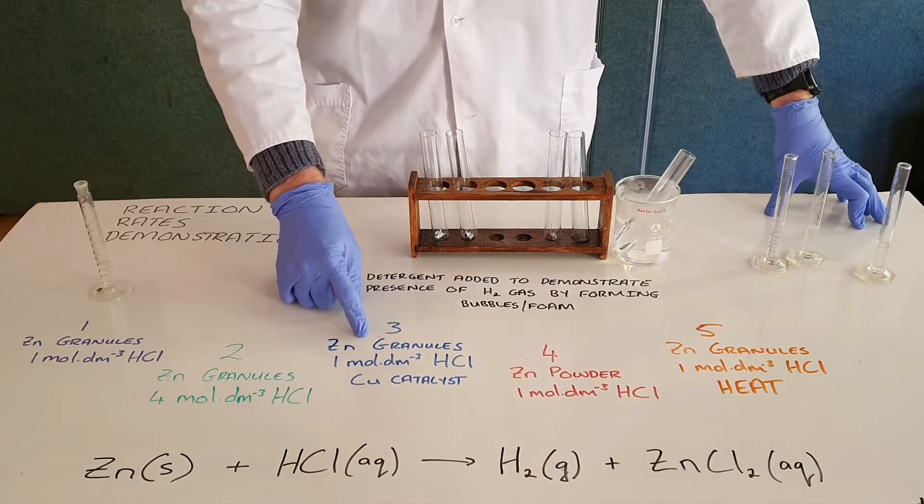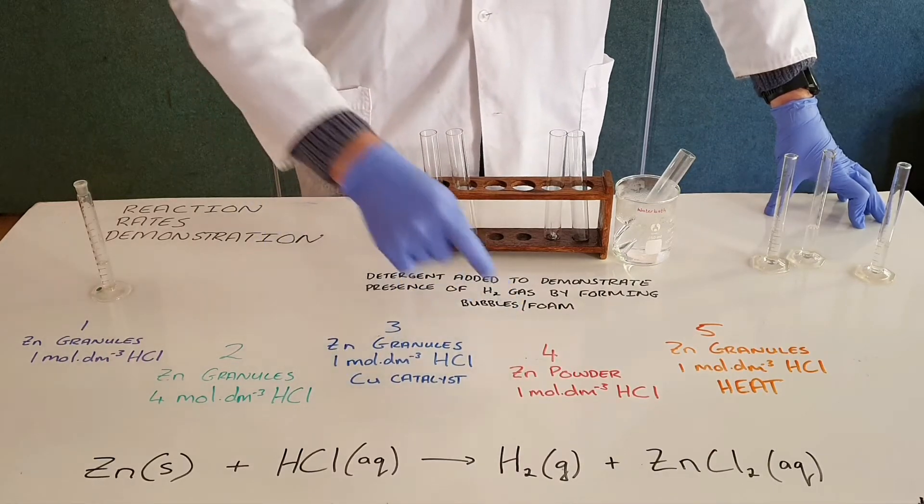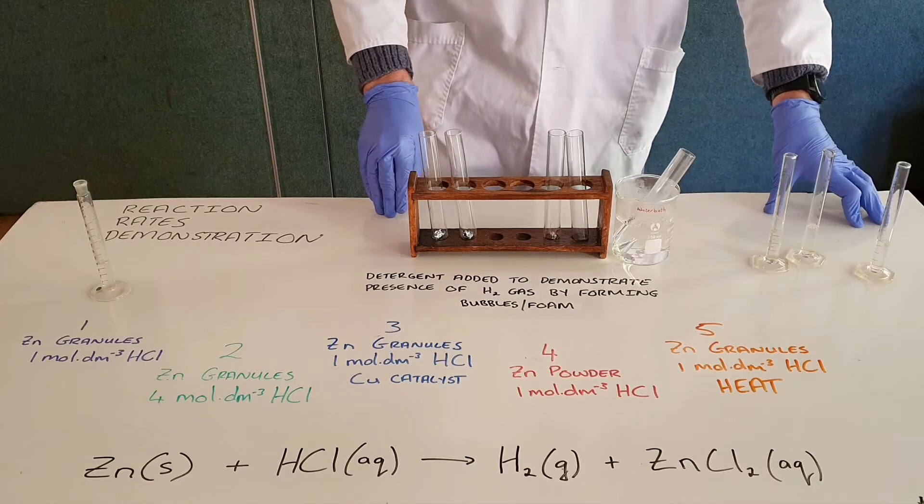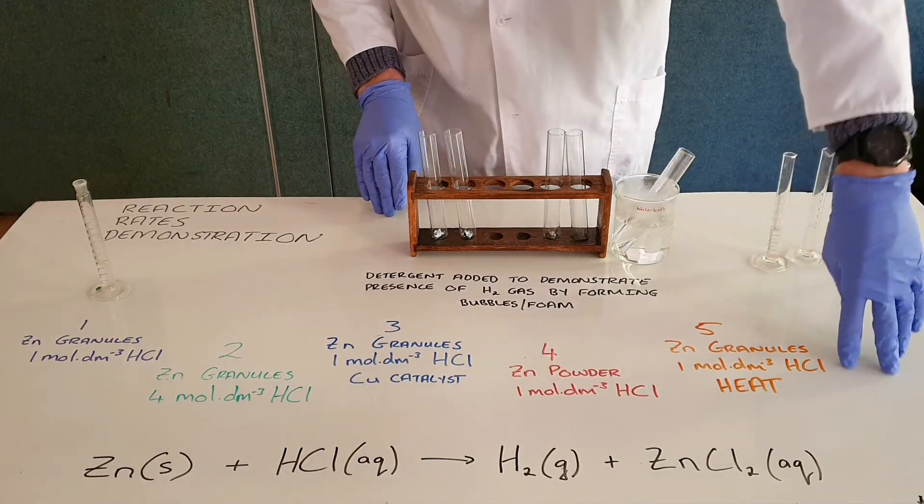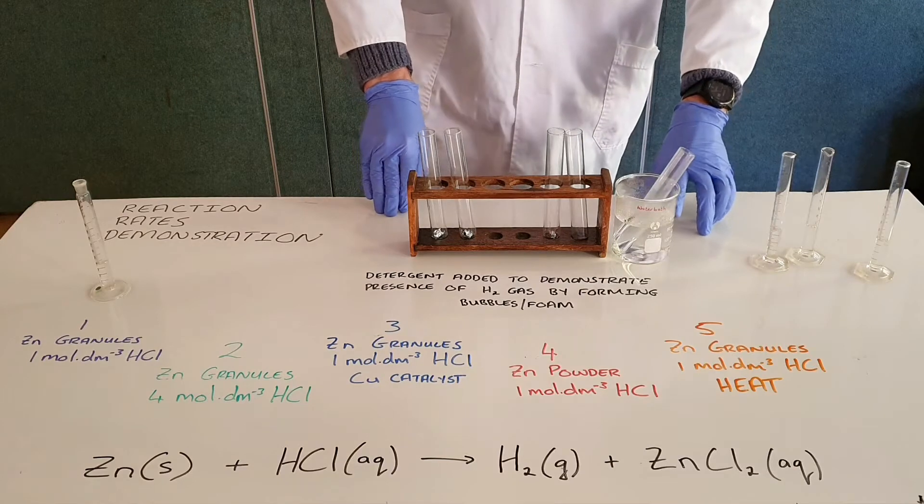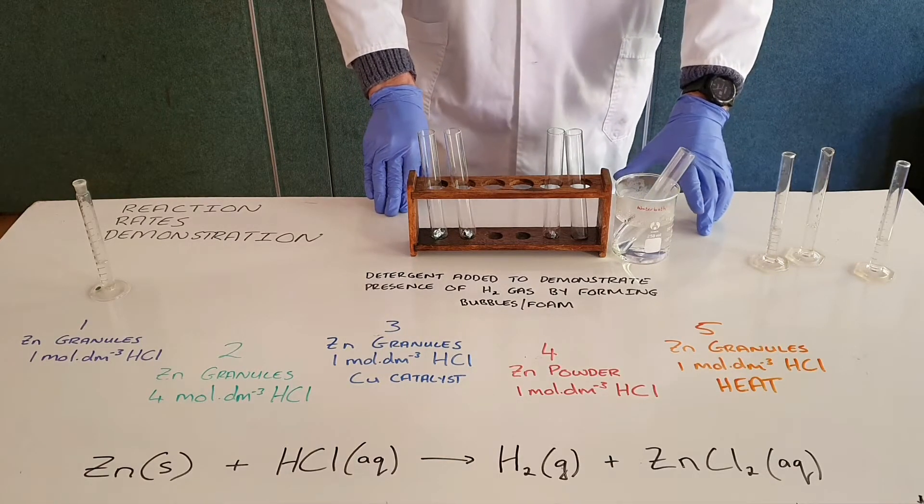The fourth test tube has zinc powder with the 1 molar hydrochloric acid solution, and the fifth test tube has zinc granules and 1 molar hydrochloric acid but placed in a hot water bath to speed up the rate of reaction there.